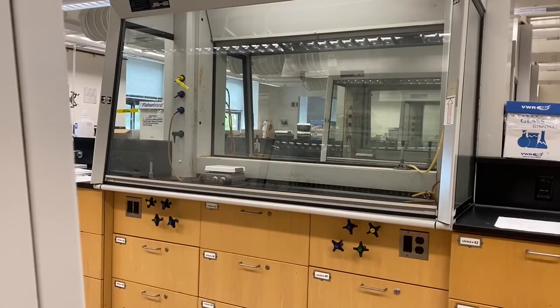Another piece of safety equipment in the lab is the fume hood. Sometimes we'll be working with noxious vapors and we'll have to do our work under the fume hood. The fume hoods are not running right now because this is the summer. However, during the school year, the fume hoods will be running continuously, and every 1 or 2 minutes they will completely recirculate the air in the building. This is also good for preventing the spread of COVID.